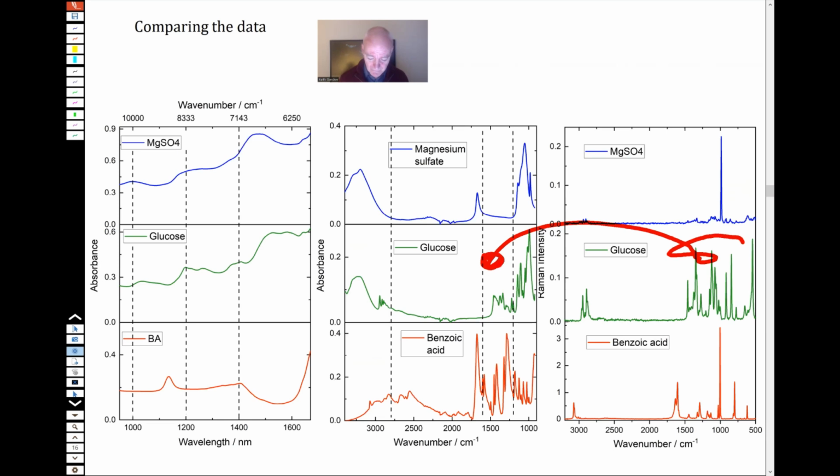In the case of the mid-infrared, the bands are rather broader. You also get some distortion of the bands due to the fact that you get some particle scattering. And then over here, you get the quite bad particle scattering, actually, which distorts the bands again. But you also get these sort of humps. They're almost like UV spectra. They're quite indistinct in some ways.